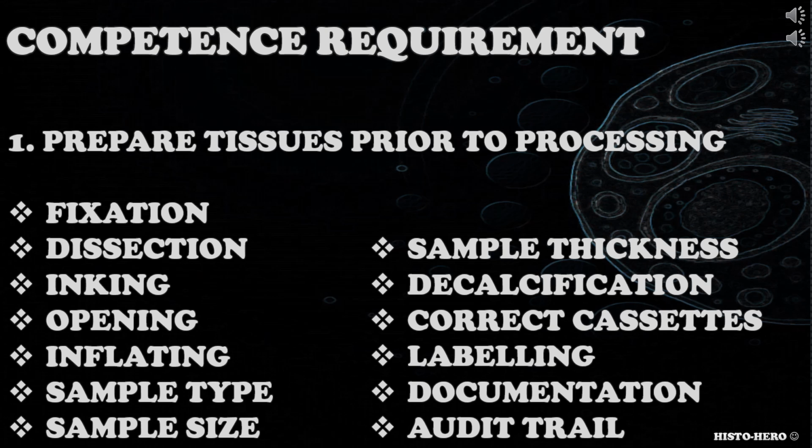When addressing this competence requirement, candidate could consider fixation, dissection, inking, inflating tissue like lungs, decalcification if needed, preparation of various sample types, sample size, choosing the right tissue cassettes, proper labeling and documentation, and so on.